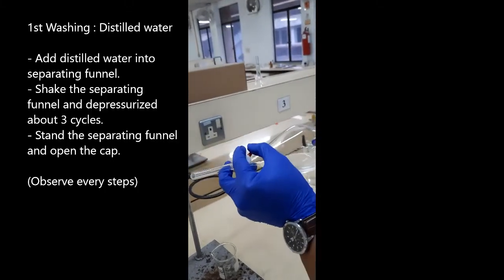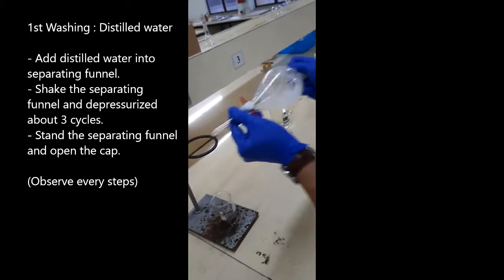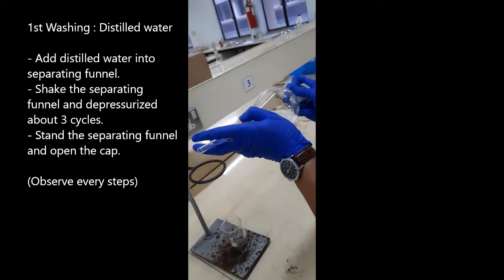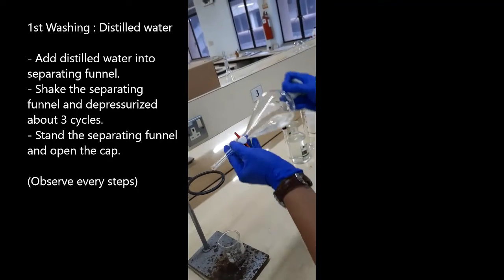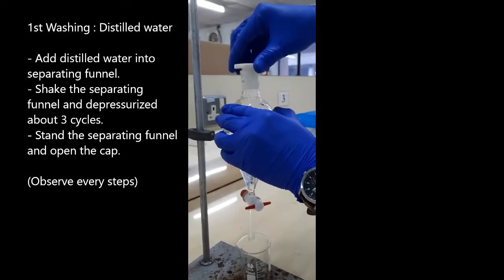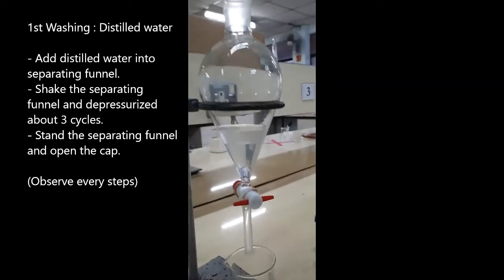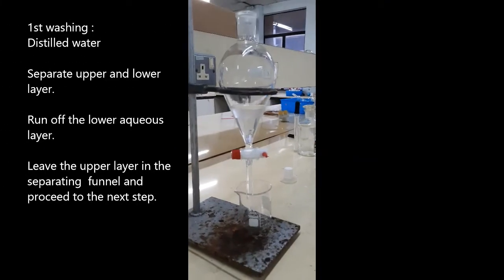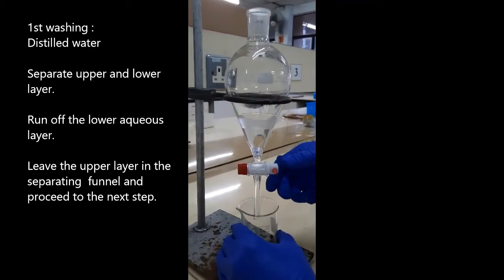Do not forget to close the valves. Allow the separating funnel to stand for one minute before opening the cap. First, run off the lower aqueous layer in the separating funnel.